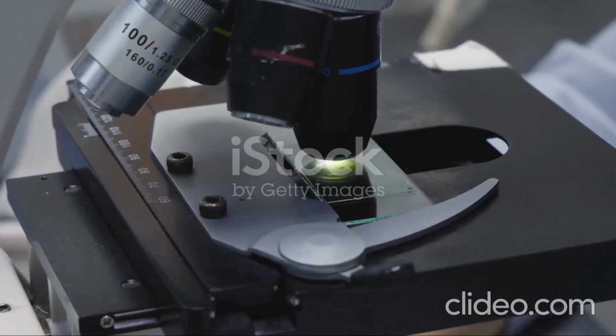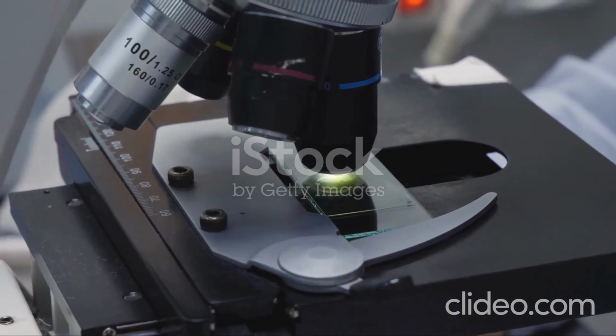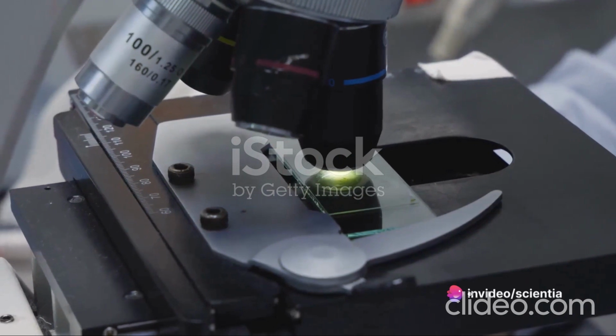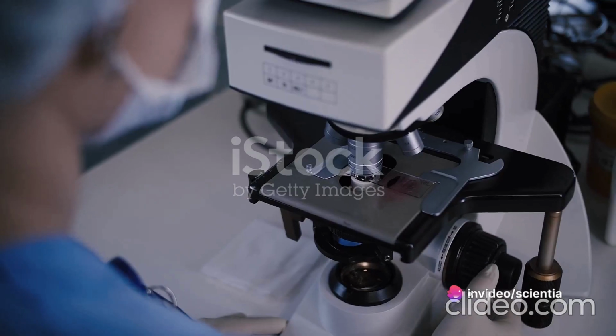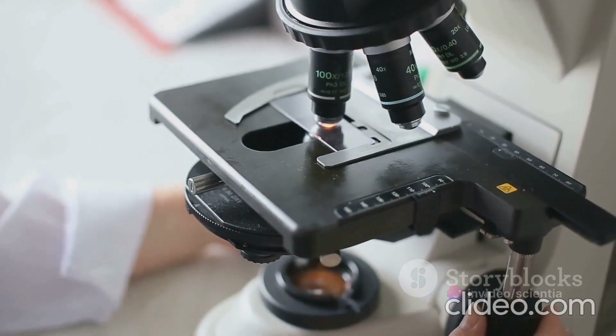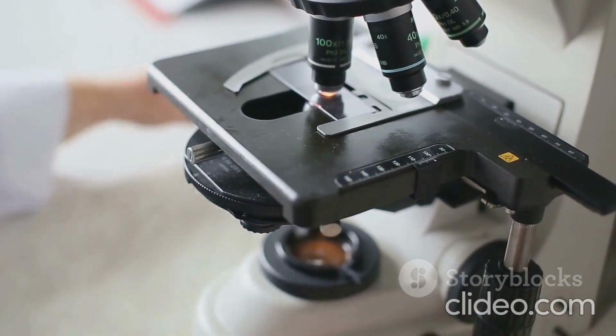This traditional device magnifies images using visible light and a system of lenses, allowing us to see intricate details of samples. In a diagnostic laboratory, it's used for routine examinations of tissue, cell cultures, and fluid samples.